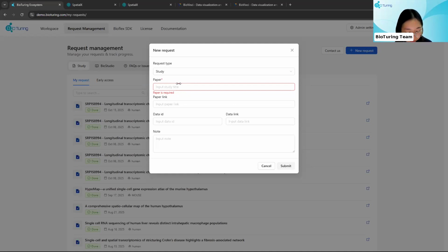Sometimes within that AnnData file type, they have already performed the embedding for you. So when you submit the data to SpatialX, you can actually access that embedding already because it should have been imported upon submission. Otherwise, you can also just rerun the embedding based on your own parameters, or you can follow the author's parameters as well, rerun that embedding and perform the workflow from there.